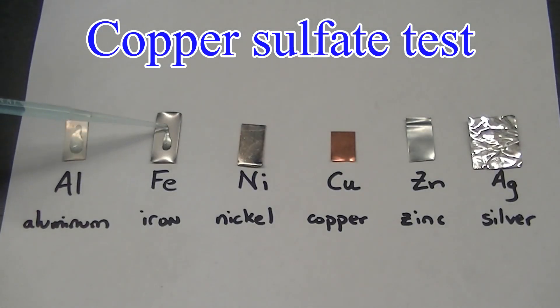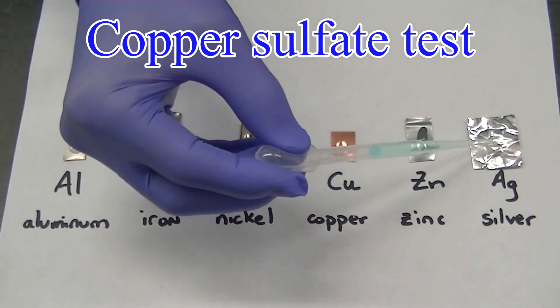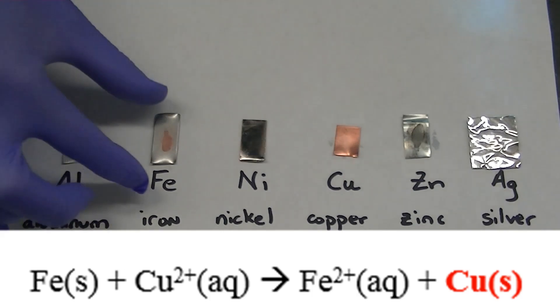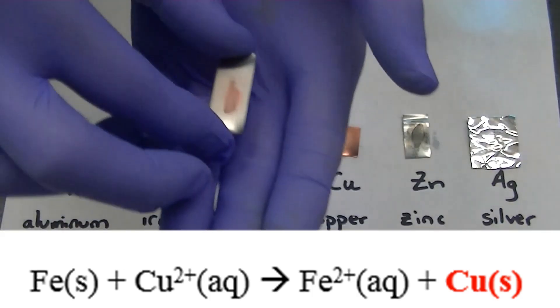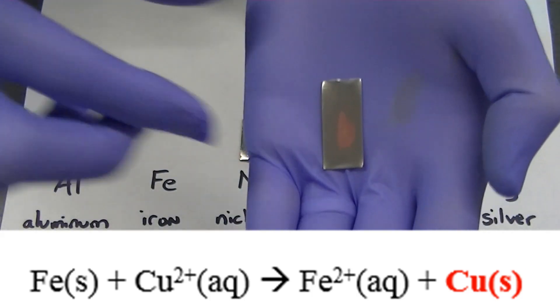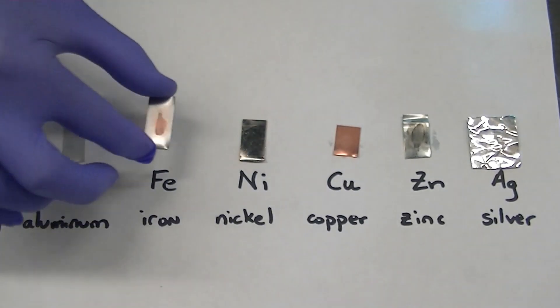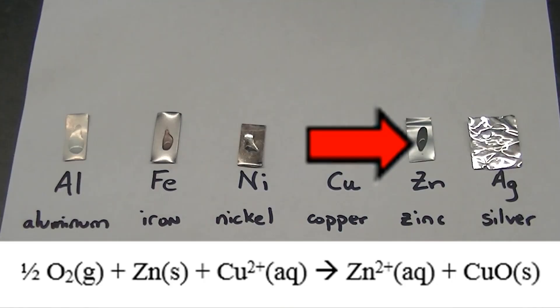In the copper sulfate test, a solution of copper sulfate that has been slightly acidified is applied to the surface of metals. On the surface of iron metal, copper ions react with the iron metal to form solid copper — you can even see the solid copper plate out with a slight orange color on the surface of the iron. Zinc metal also shows evidence of reacting with the copper solution; in this case a black color forms on the surface of the zinc.